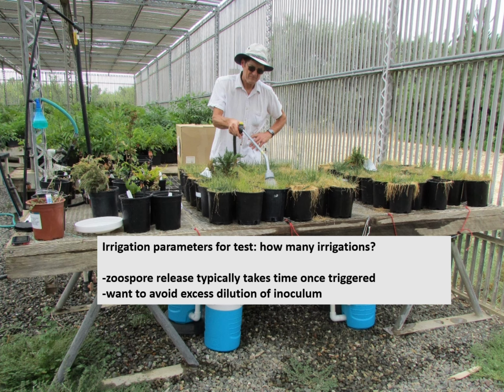Well, we know from biology that zoospore release typically takes a certain amount of time. If we want to get zoospore release from zoospores produced in the lab, we normally chill them and then have to wait 15 minutes to the better part of an hour sometimes to get them to release en masse. So we want to allow enough time, enough irrigations, to have that happen. We also don't want to overdo it. We don't want to irrigate longer than we're going to have release, because we're just diluting the inoculum at that point.